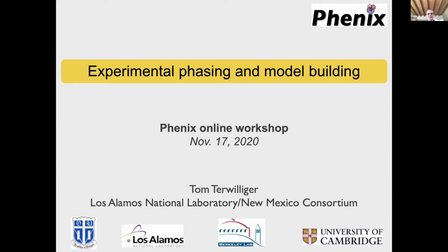Looking forward to this. In the next hour, we're going to solve a structure by SAD phasing. Let's first look at a little bit of the big picture about experimental phasing and model building. And then what we're going to do in this session is I'll give you a little bit of lecture, but before each lecture, we're going to do something.